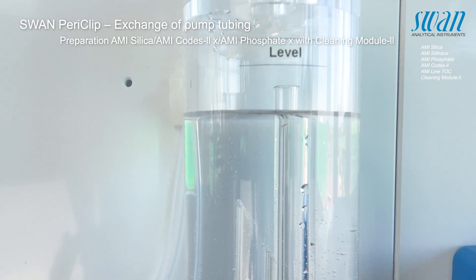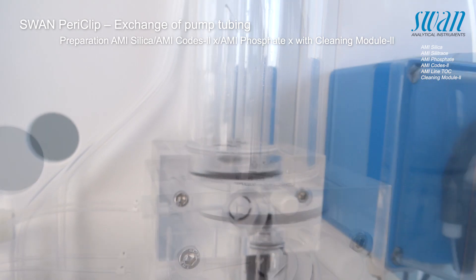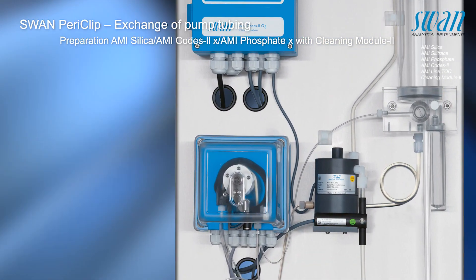Stop sample flow and wait until the flow cell is completely empty. Shut off the power for the instrument. The instrument is now ready to have the pump tubes exchanged.